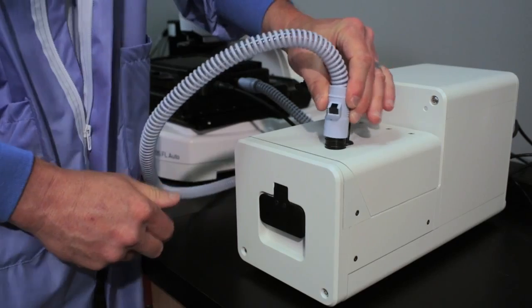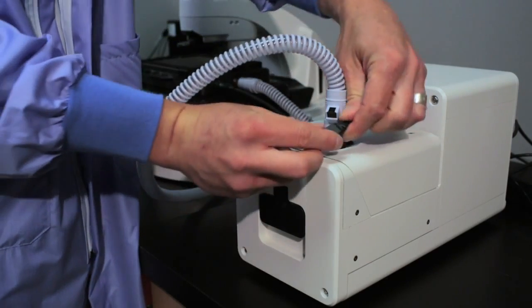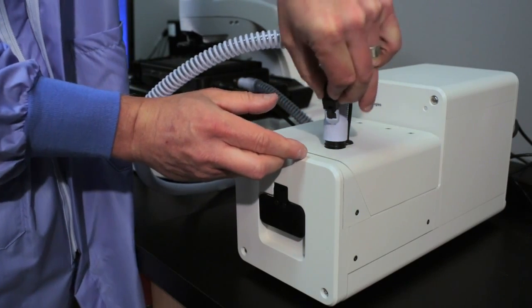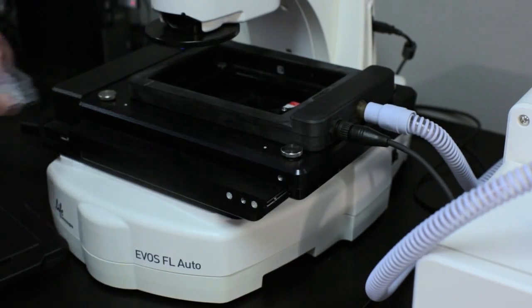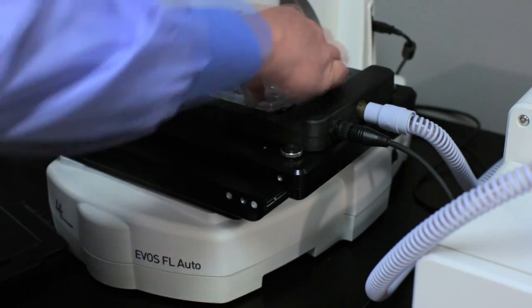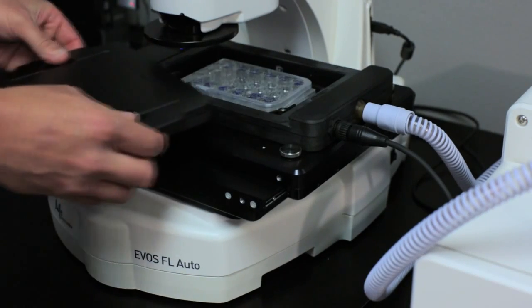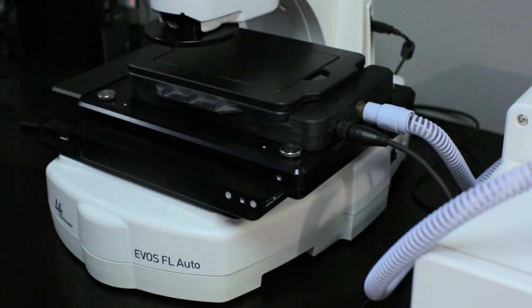Place the incubator hose onto the control unit, then connect the black sensor to the incubator hose. When turning on the unit for the first time, place an empty plate on the unit until it reaches the appropriate temperature. This will prevent condensation and improve performance. Place the cover on the incubator using the magnets to guide and hold the cover in place.